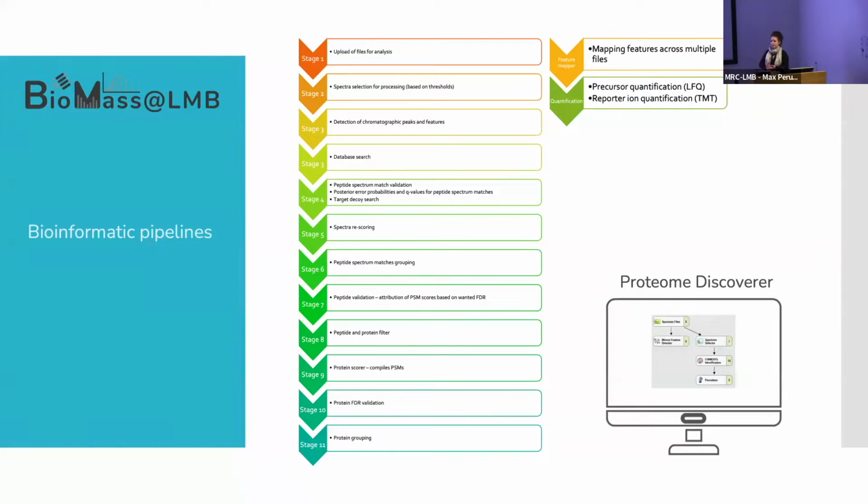very straightforward. It's not necessary to have an ongoing conversation about the project because you just want to identify a protein. But in some situations, we actually want you to come back to us and say, right, I want to see exactly what are the unspecific binders of my IP. And we can do a slightly different search. You can actually mark these unspecific binders onto your results. So you can see, okay, these ones are not interesting. So there's several things we can do.